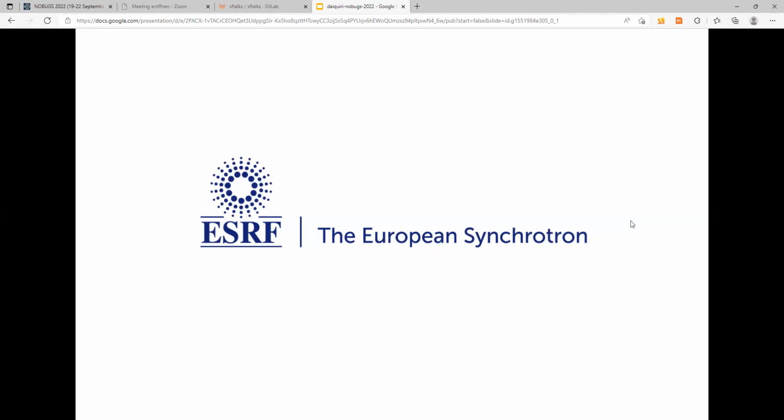I don't think we've got much pushback for the main user interfaces we've deployed. I21, they drove the whole development pretty much. They knew what we wanted, and we converted that from requirements into deliverables. Let's follow up on that. What feature has been the most attractive for those users?